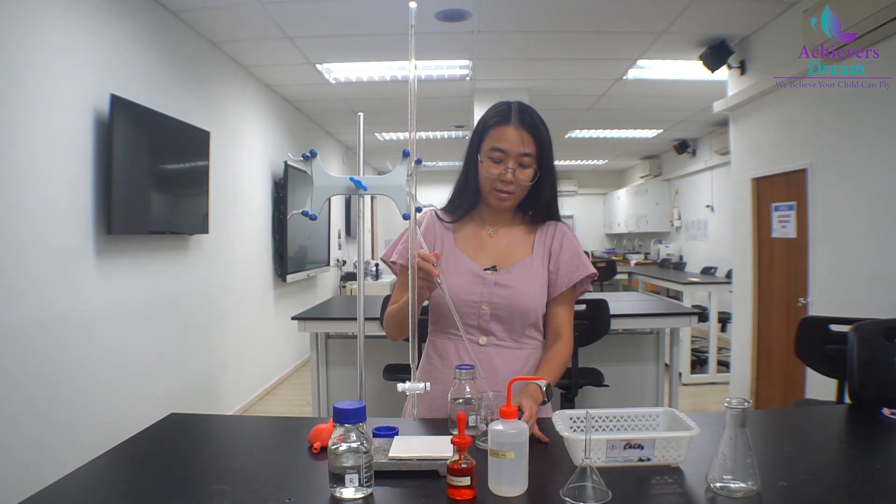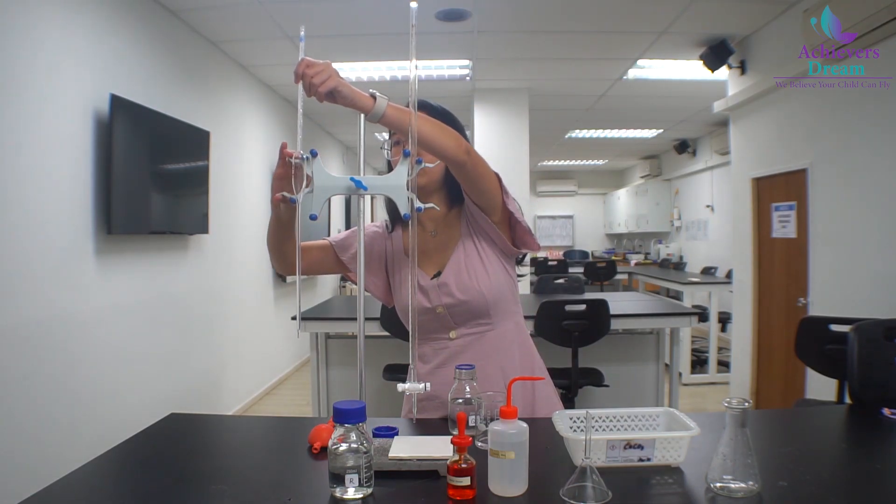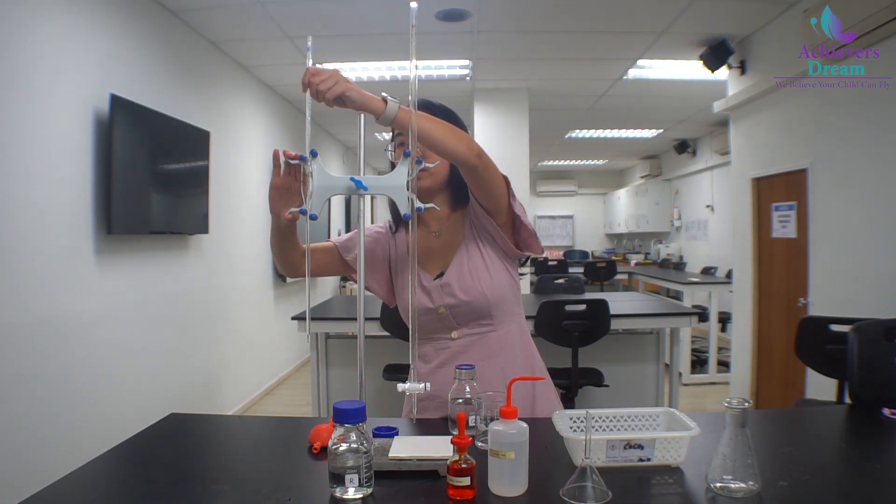Once all the solution has been discarded, you are done with rinsing. We can place it back to the stand and it's ready to use for titration.